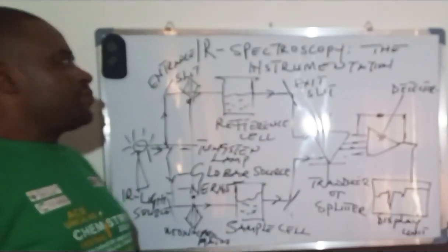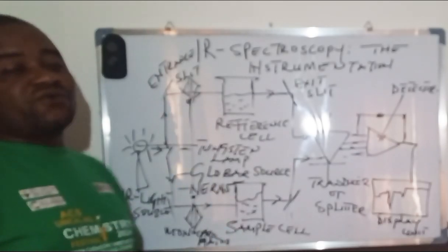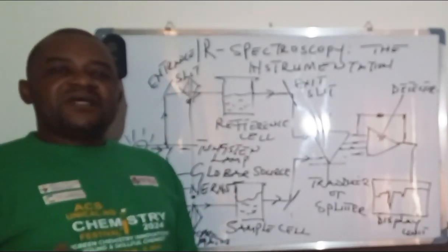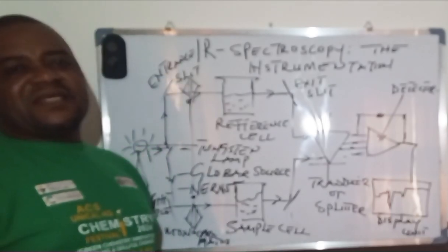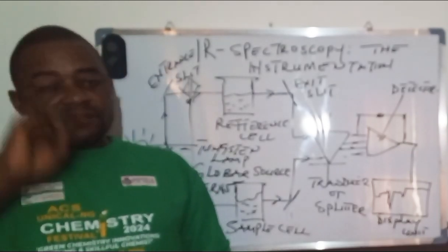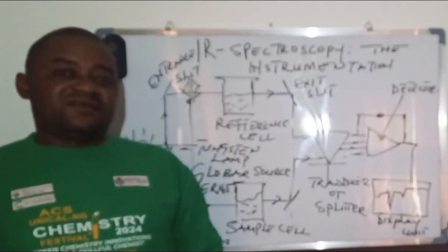But there is something very important about these monochromators. If you want to use a prism type monochromator, you may not have to use monochromators that are built from quartz or glass. Remember that in our previous class in the UV visible spectroscopy, we had told ourselves that you cannot use glass, for example, to build monochromators for the UV.